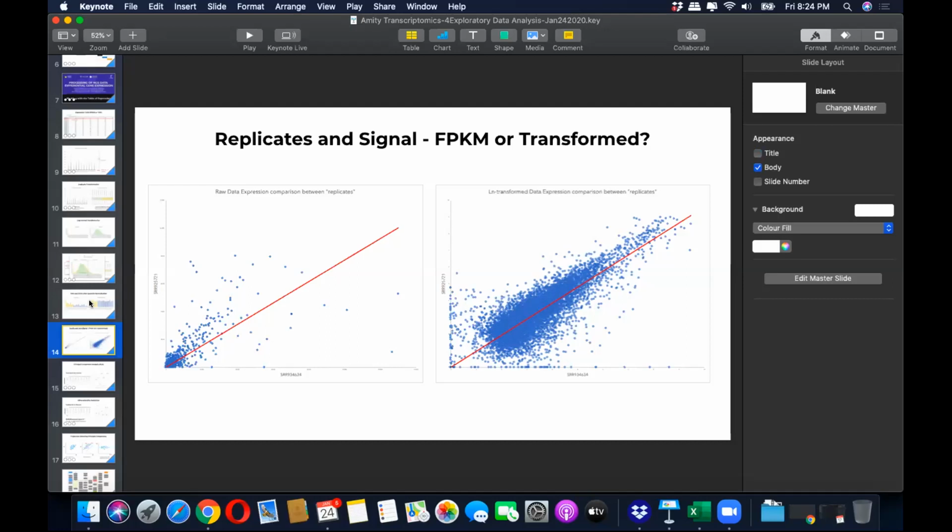So now that we prepared the raw data, let's see how we can learn about the whole data set and the properties of the data. We can't see if the genes have comparable expression levels here. We just see that most of the data is concentrated around the low values and scattered all around.